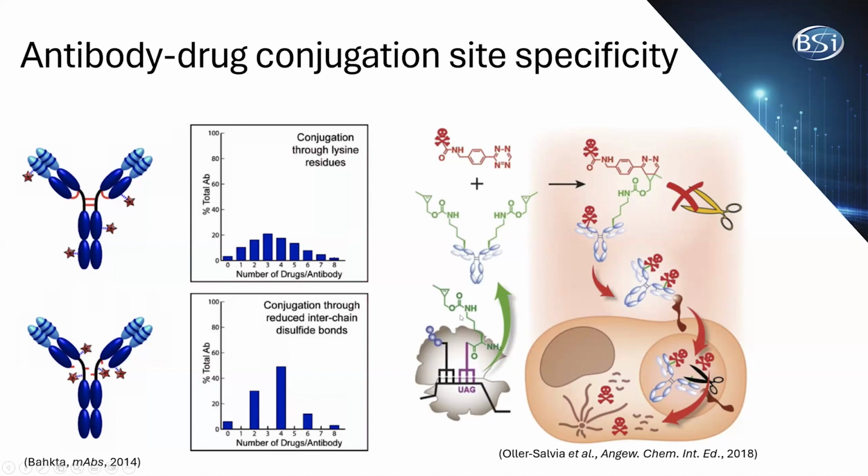And that tRNA is ligated to this chemical handle that serves as a linker for conjugating the payload to. And so in doing so, you can have confidence that that linker is only going in at that specific site where you've designated the stop codon to be.